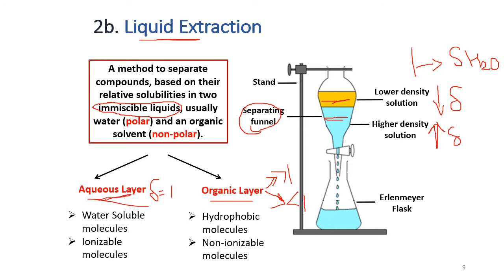The aqueous layer contains the water-soluble molecules. Any water-soluble molecule will be found in the aqueous layer. Any ionizable molecule that can form ions, with a plus and negative, will also move into the aqueous layer.